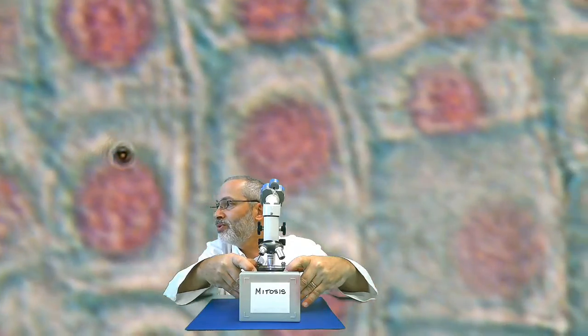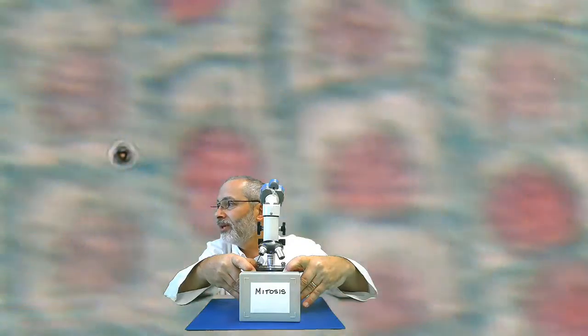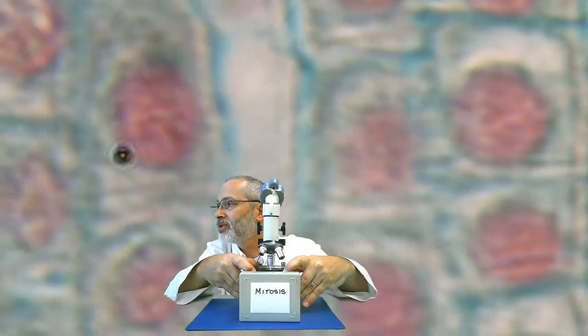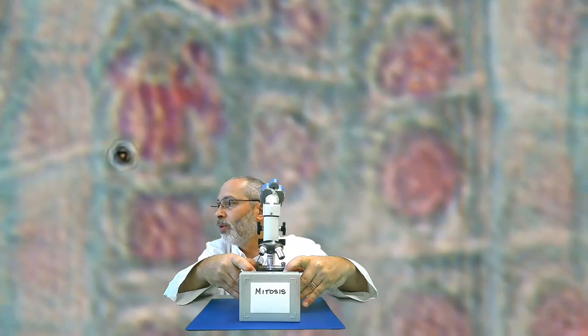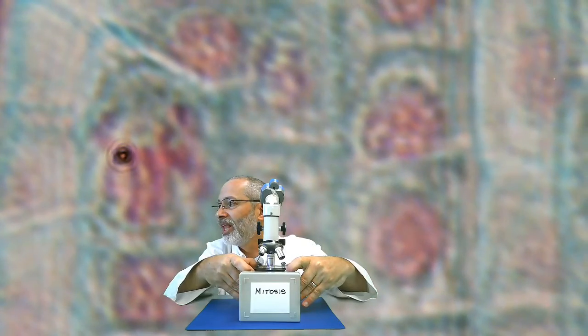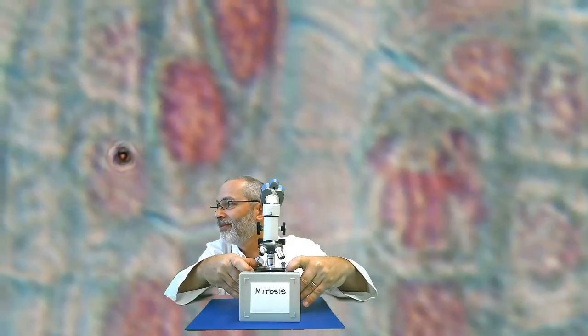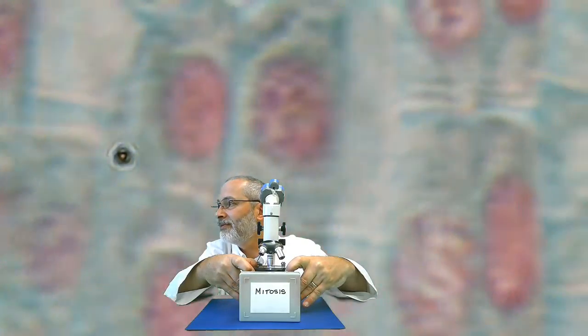And I'm moving the stage of the microscope around slowly to see if we can pick out some. Oh, look at that. You can see some chromosomes lining up there. Think about what phase that might be.